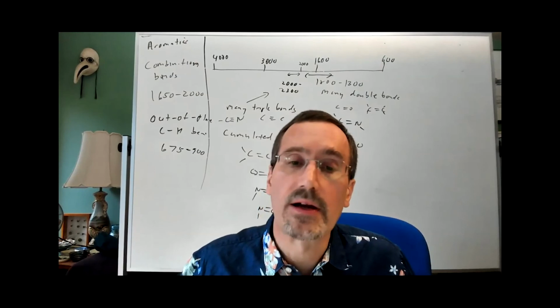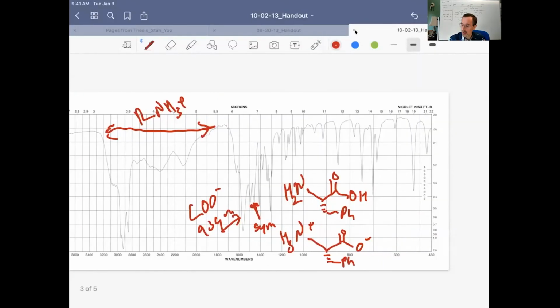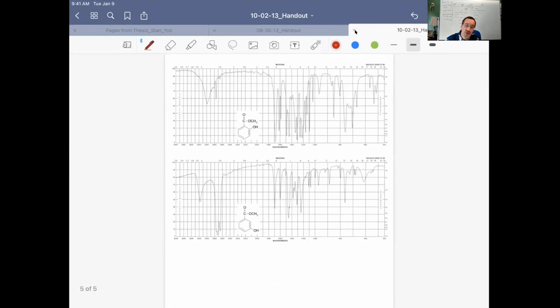because it's so characteristic. And again, I think I've taken this from Nakanishi's book. So this is, Nakanishi went through and sort of recorded all the patterns you see for various substitution patterns. For simple phenyl compounds, you may see this set of sort of 4 bands between about 2000 and about 1650. And then you could correlate with the out of plane CH stretches, CH bends. And let's see, oh, we'll skip this example.